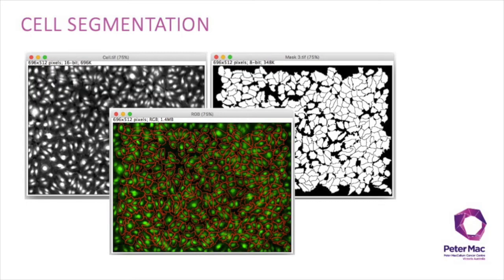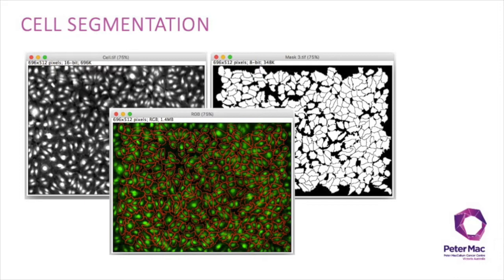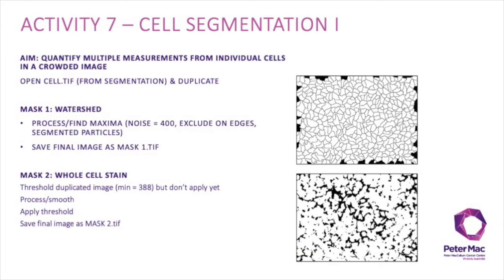In cell segmentation, we're going to use the intensity of an image to segment out cells. We'll then use Fiji to quantify different aspects of each of the individual cells and the cells as a whole in the image. Activity 7 is the first step in cell segmentation where we create two masks to use later on in the analysis.